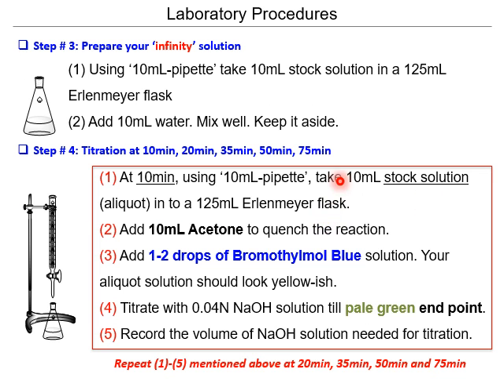The next step is preparing your infinity solution. Transfer 10 milliliters of your stock solution to a 125 milliliter Erlenmeyer flask and add 10 milliliters of water. Mix it well and keep it aside. It's your infinity solution.